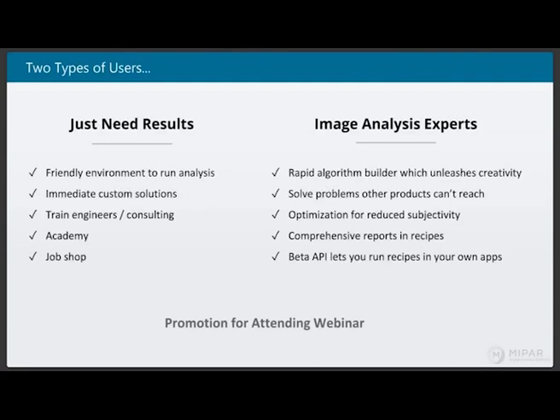But like Paul said, all problems are different. Many of them can be solved a number of different ways. MIPAR is about enabling the users to solve the problems that they need solved as quickly as they can, and for enabling the others to have those solutions delivered to them easily if they don't have the experience to make them themselves.